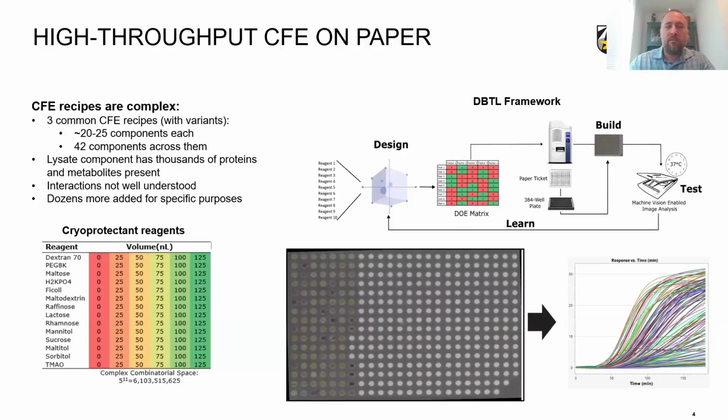Doing these experiments just in liquid reactions with no paper, in plastic plate setups that have small wells that allow you to add different components, people have worked on that and made some progress, including us. But no one had really worked on how you do this in the presence of paper, which can change the performance of the reactions in ways we don't totally understand.